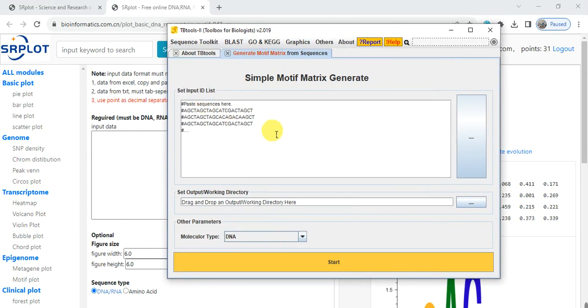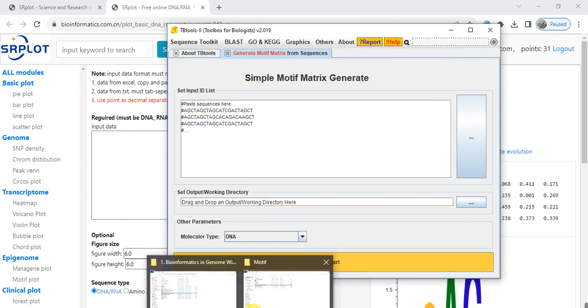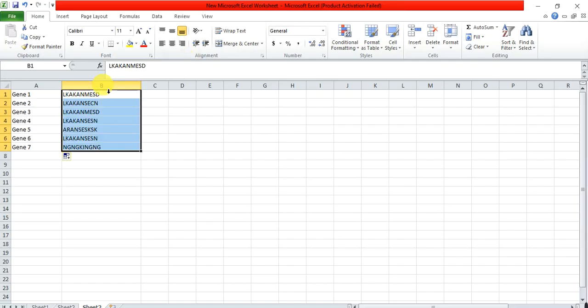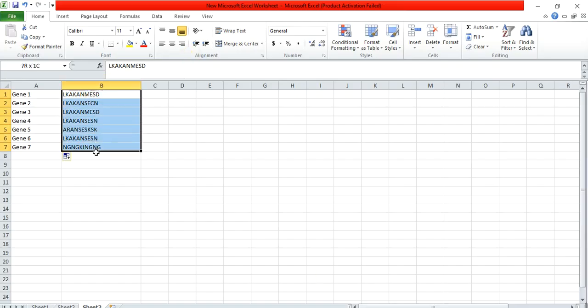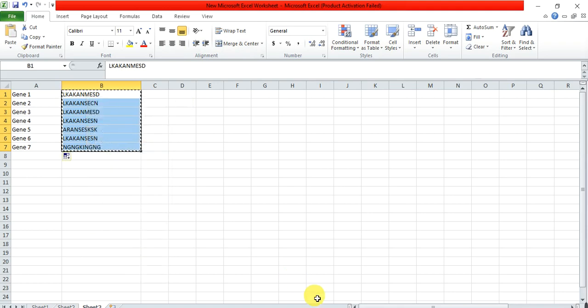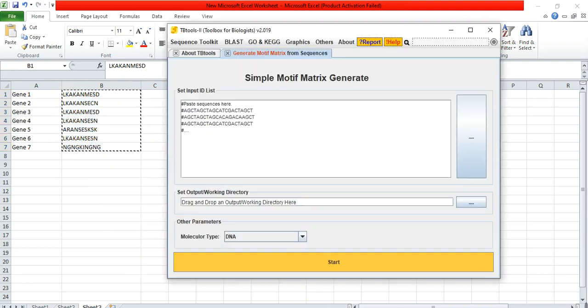Here paste your sequence. Copy this motif sequence and paste here.